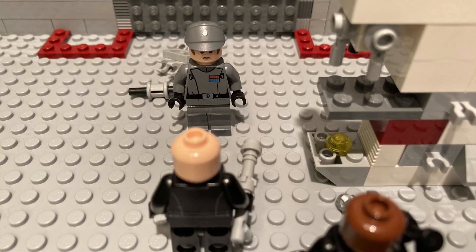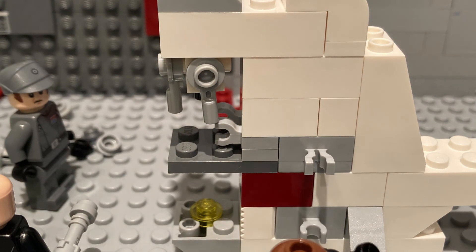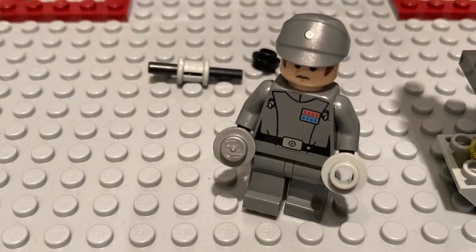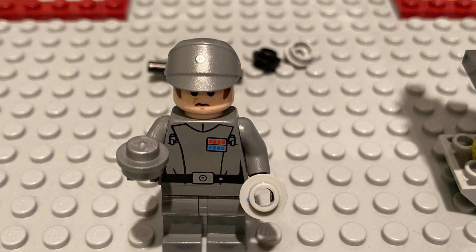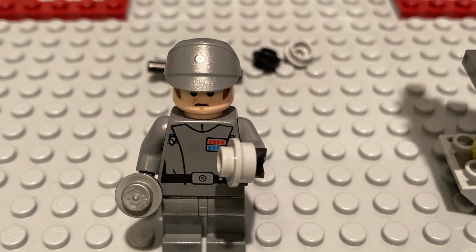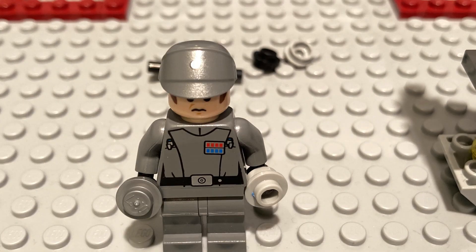Now we attach the stage clips — they'll hold the slide down. I will attach the fine focus and coarse focus knobs. These knobs raise and lower the stage. The coarse moves it a lot, but you can only use it on the red lens. Whereas the fine focus only moves it a little, and you can use it on any lens.